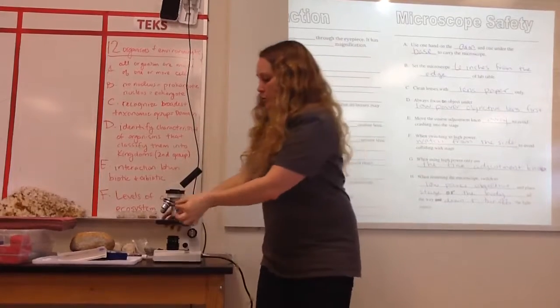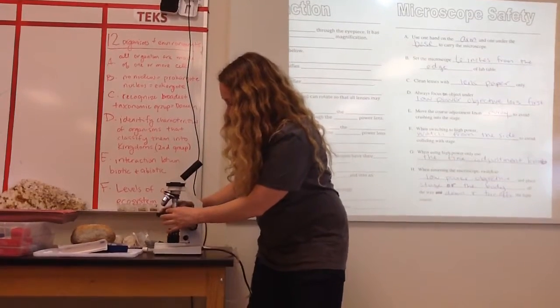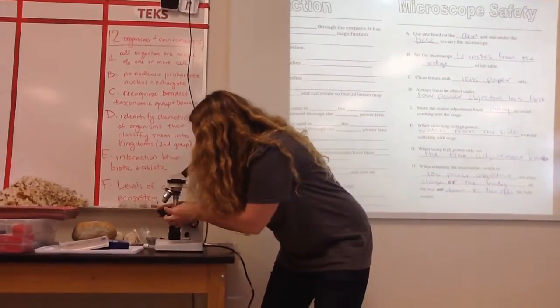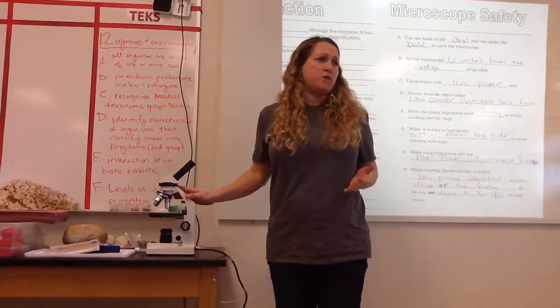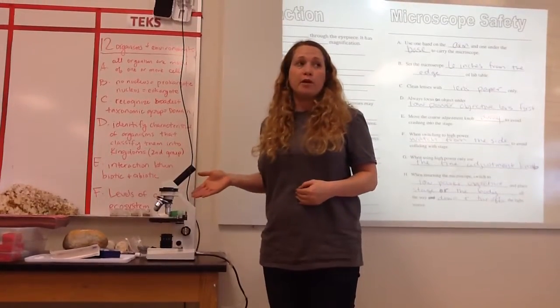So you take it, you put it under the little clips. They're called stage clips. You have to lift them a little bit. Make sure your little object goes right in the blank spot where there's a piece of glass. It's kind of hard to see. There we go. Boom. So I haven't focused it, so I won't be able to see the image well. But when I look in, I should see a blobby out of focus something. It was blue on the slide, so it should be blue when I look in.